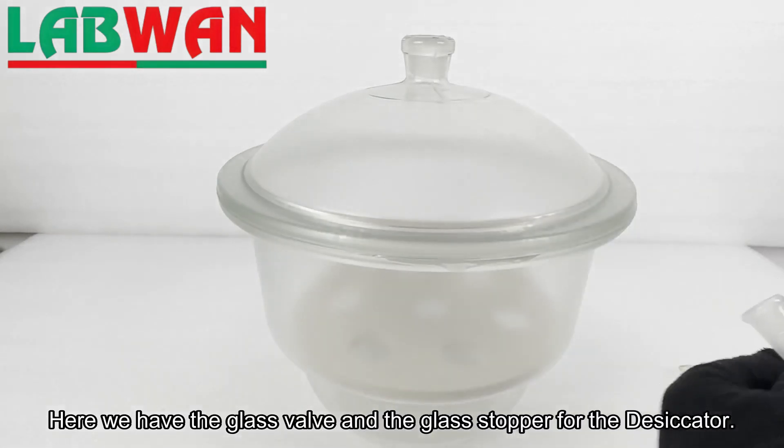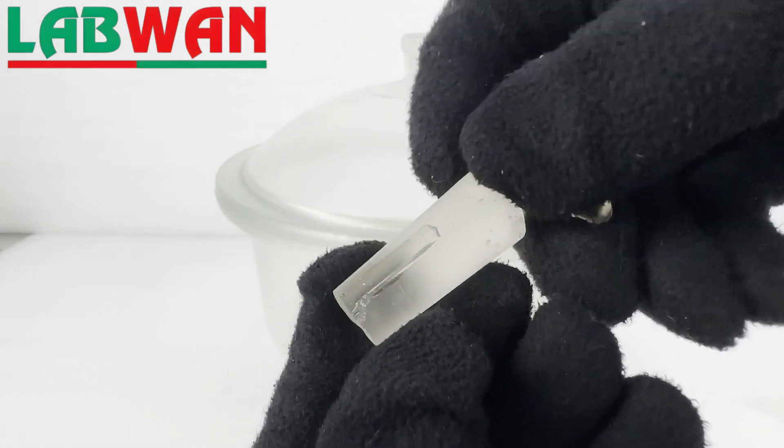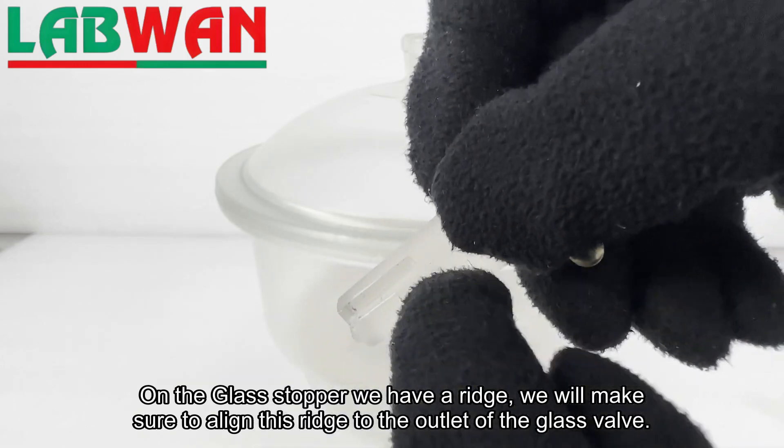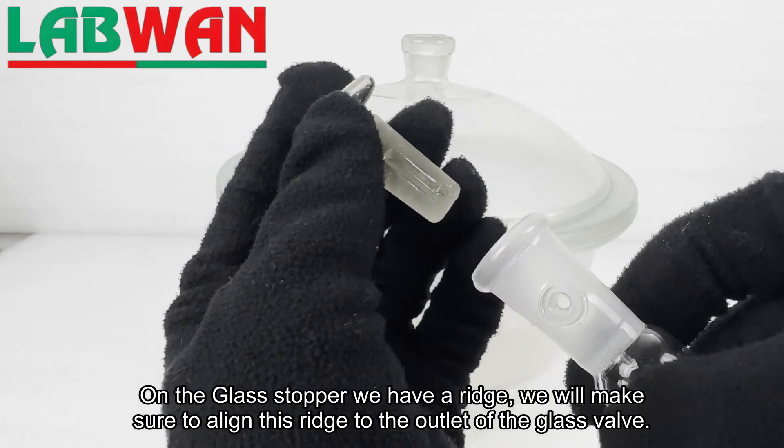Here we have the glass valve and the glass stopper for the desiccator. On the glass stopper we have a ridge — we will make sure to align this ridge to the outlet of the glass valve.